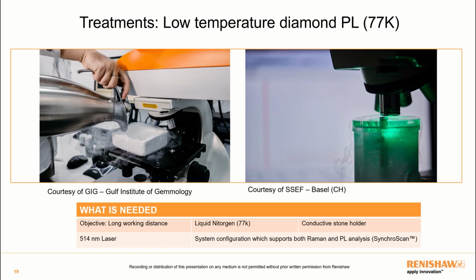As said, the photoluminescence experiments must be conducted at low temperature. In these conditions, in fact, the permitted transitions are limited in energy, and consequently the corresponding Raman bands are narrower. Different setups with liquid nitrogen can be used, as you can see from these two pictures, but what is important is that the temperature is kept constant during all the measurement.